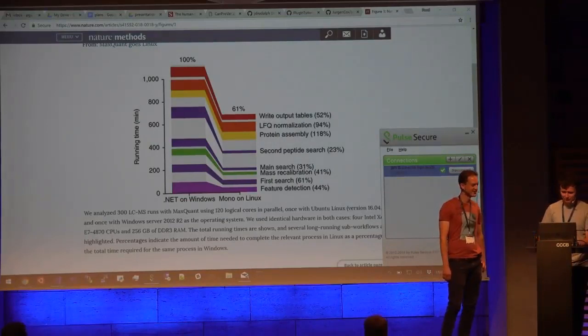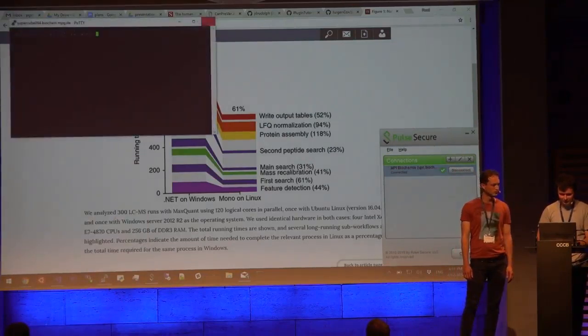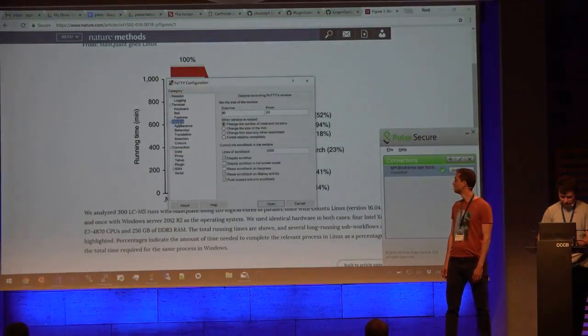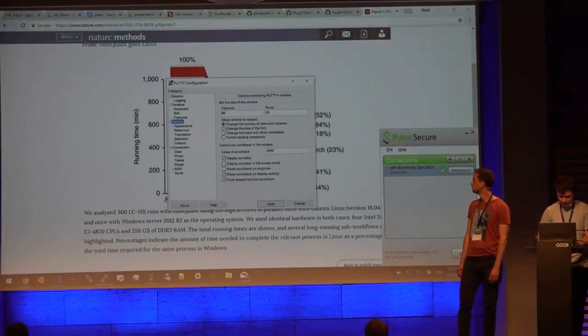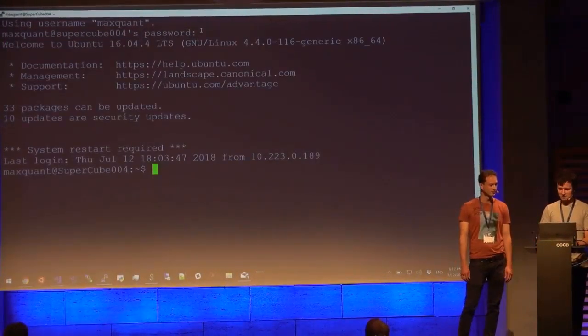Okay, as you see, I'm right now standing in a Windows operating system, but now I want to connect to our computer, which is standing in Garching, somewhere near Munich, in a room full of CO2. I just want to make it beautiful because it's really hard to see. I will change it. I now open it. Okay, I will write my password.